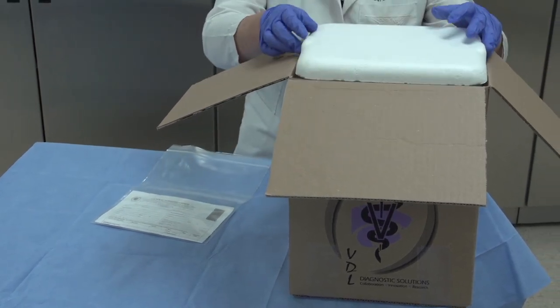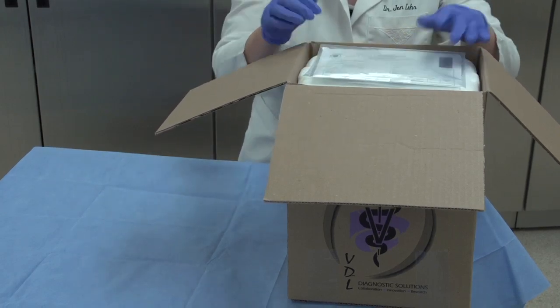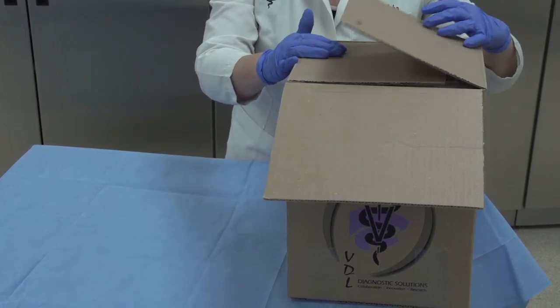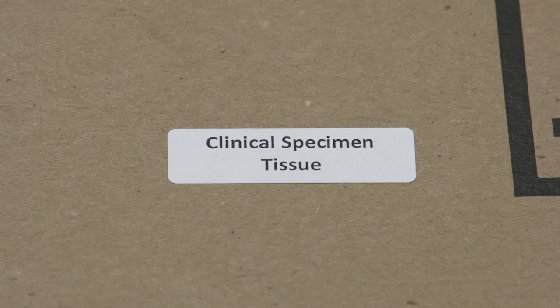If sending a large volume of tissue, it is best to chill the tissue overnight in the refrigerator prior to shipping it with ice packs for overnight delivery. The box should be labeled with UN-3373, an animal diagnostic or clinical specimen, as these samples are potentially infectious.